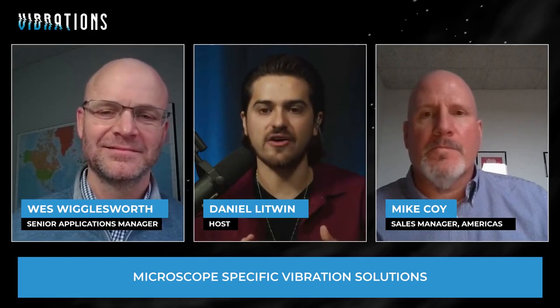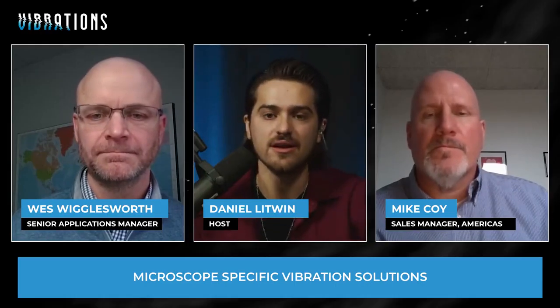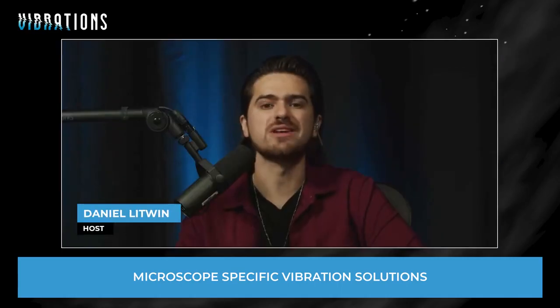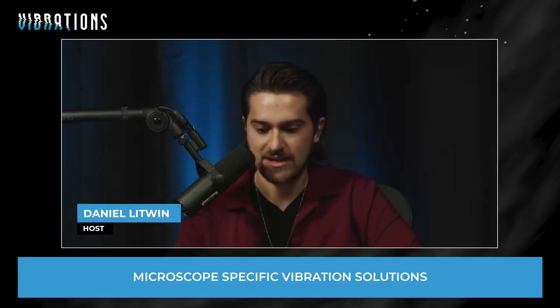To try to find that ant in a metropolitan hub. And it just goes to show that, especially when we're talking these mission critical applications, using high-powered microscopes in lab settings, in manufacturing settings, whatever it might be, vibration control is a necessity. It's not a nice to have. It is key. So let's get a little deeper.